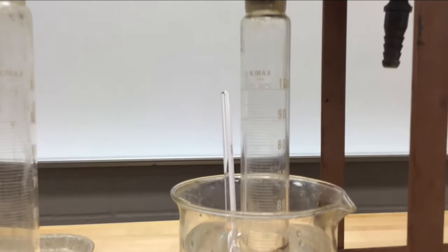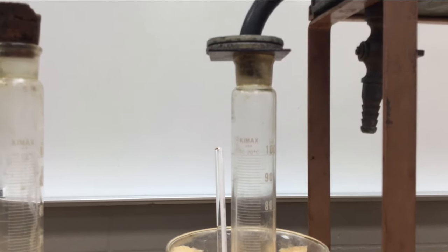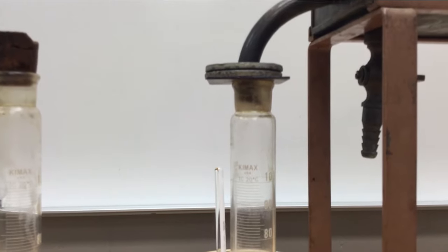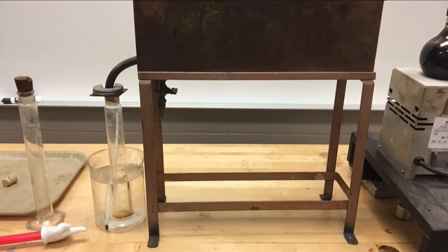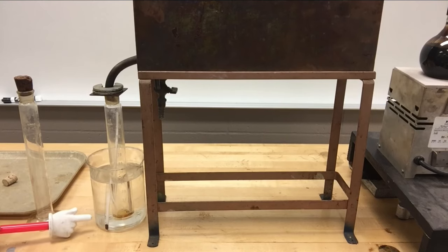See the dripping coming out of the tube there. And we've got something on the top of it to help keep any light vapors, if there were any, from escaping. Oh, there was another drip right there. So we're at about 250 degrees right now. And if I'm looking to see how much we have, I would say we're going to call it 3 milliliters so far.